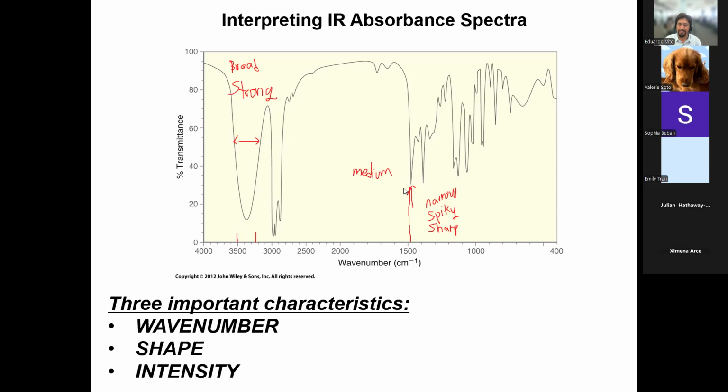You see? This is how we talk about these peaks. When we're talking about peaks, we're using descriptor words. Is it broad? Is it narrow? Is it strong intensity? Is it weak intensity? Is it medium intensity? Is it very strong intensity? Is it medium strong? Is it medium weak? All of these words are valid, right? Because it's English. We speak English. We are looking at it and describing the properties of these shapes. So I want you guys to practice doing that.